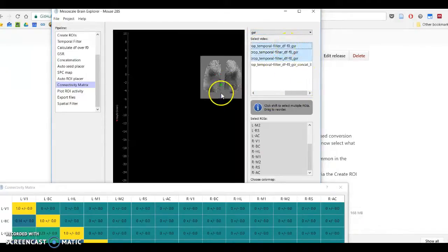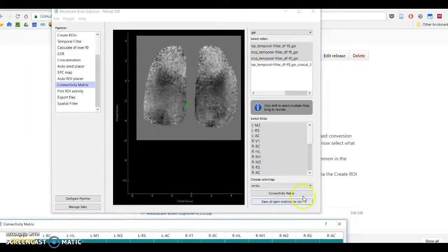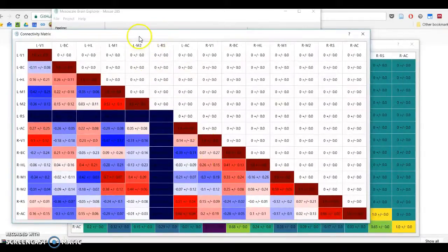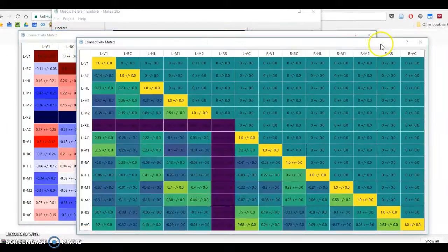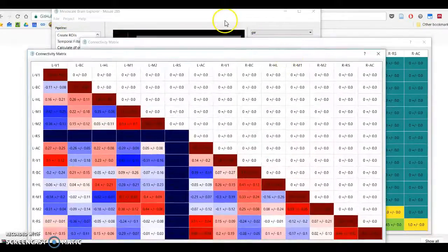Say I selected all of these at the same time, and now what I'm going to quickly do is head over to, let's pick seismic this time, and replot the connectivity matrix. Right, here's the output, and as you can clearly see, seismic is really well suited to clearly differentiating negative from positive correlation. And again, it's a diverging color map, unlike this one, which is sequential, but it is at least monotonically increasing perceptually from the center towards the blue or towards the red.